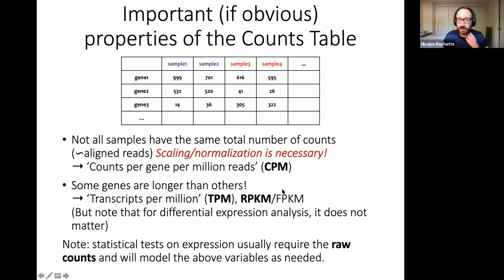Okay, that's what I had. There's a question. Oh, TMM normalization, yes. TMM normalization is just trying to... close the window. Not close, but TMM normalization.